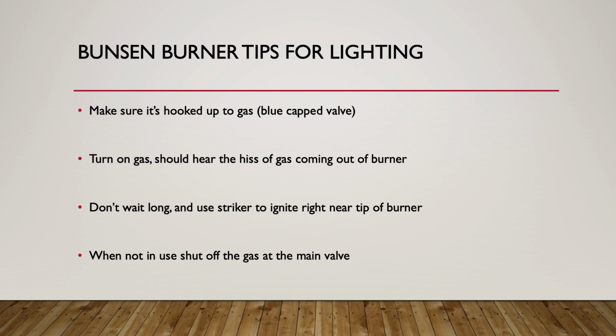You want to make sure that there's not gas just flowing that's not burning either, because if there's a big buildup of gas and there's a bunch of people in the room with strikers lighting their own Bunsen burners, now we have the potential for very big flashes of flame that are not necessary. So we want to take very good care and caution as we're using our Bunsen burners. And like I said, just follow the simple steps.